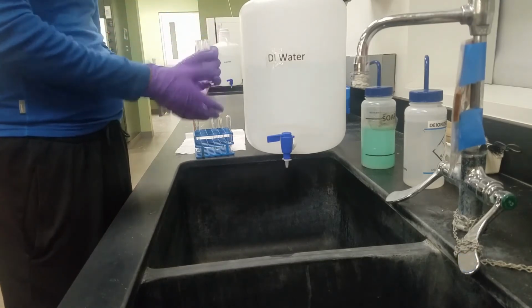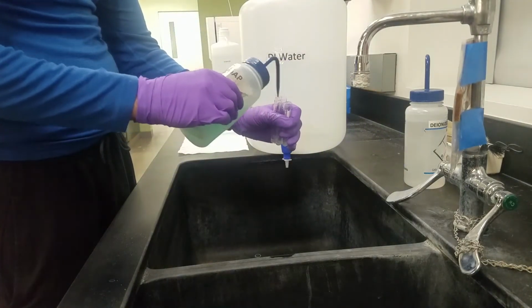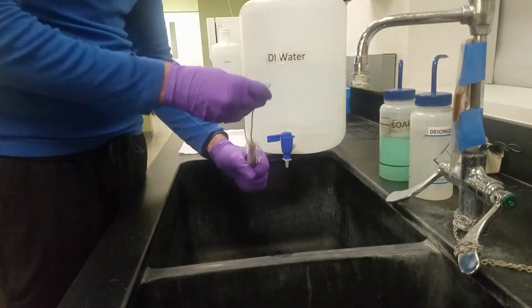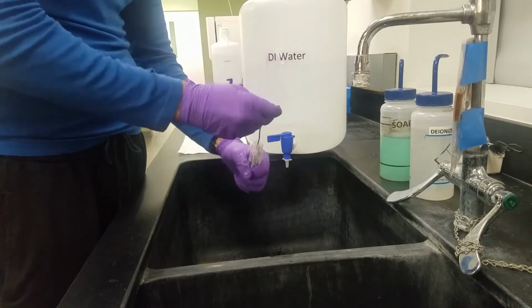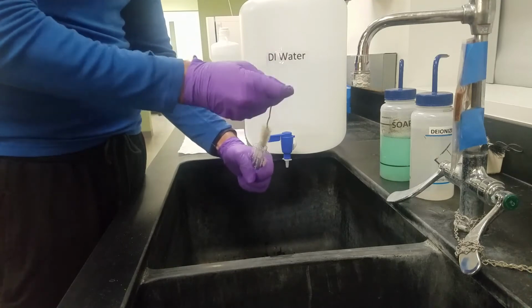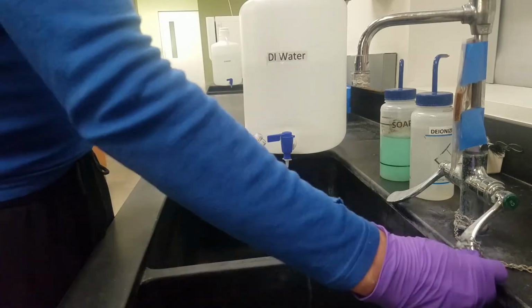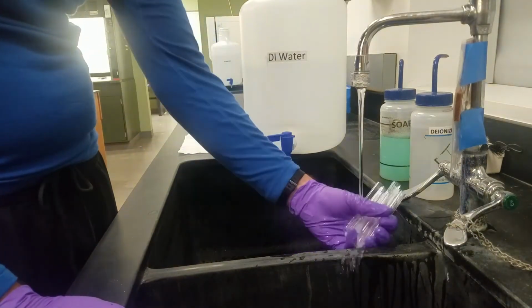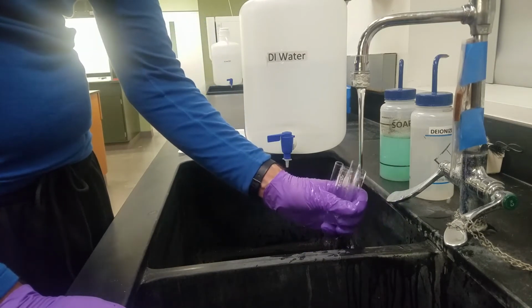When we move to the sinks to do our cleaning, with test tubes, you'll notice I'll take a fistful of test tubes, fill them up with a little bit of soap. I like adding a little bit of water to help me get a little more froth, and then clean each and every single one of them with a scrub brush, making sure that your glassware is constantly touched by soap so that you can remove those nasty chemicals. Once you've done the soaping process, then you can move on to rinsing. All we're trying to do is remove the bulk of that soap and get it all out. And really, not even the bulk, all of the soap.